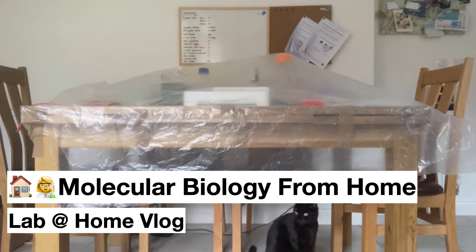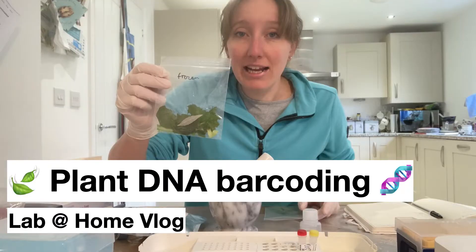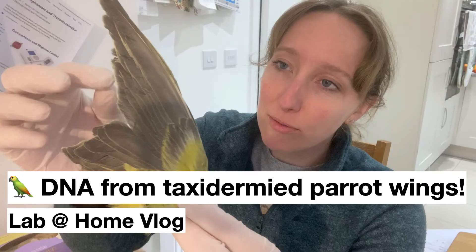I started off the first vlog by showing you my Lab at Home setup on my kitchen table, with occasional guest appearances from my cat Smithy. In subsequent vlogs I extracted DNA from a range of sample types including mushrooms from my fridge and collected from my neighbour's garden, plant leaves picked from my garden and house plants, my own hair and spit, and from feathers sent to us by collaborators and plucked from taxidermied parrot wings that I'd bought off eBay.